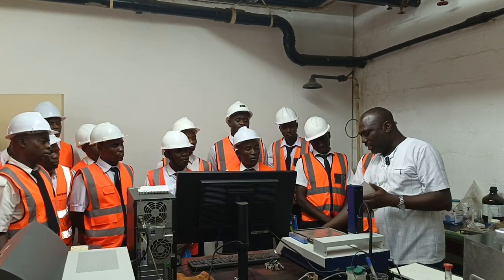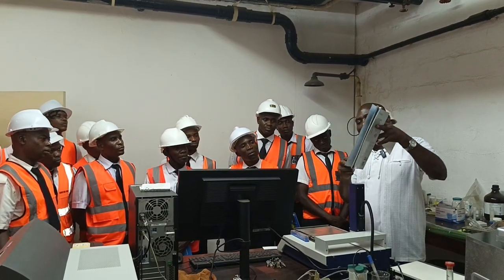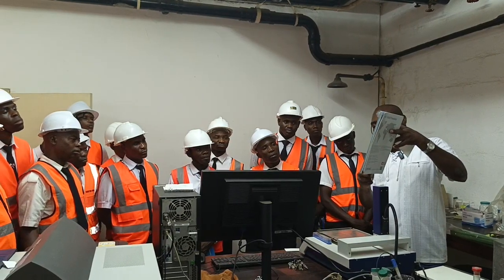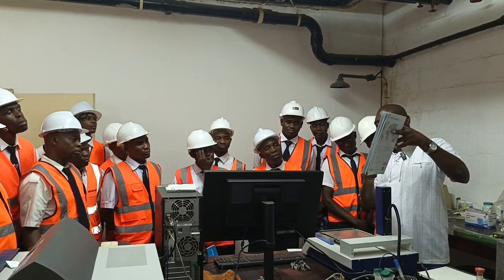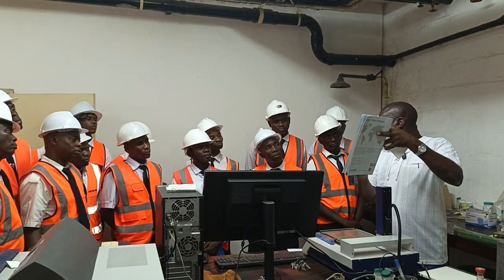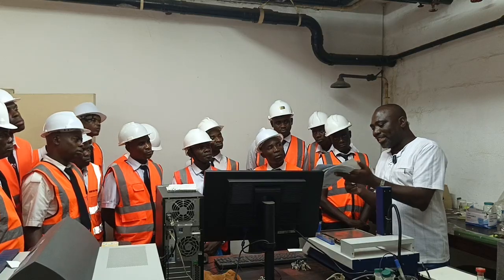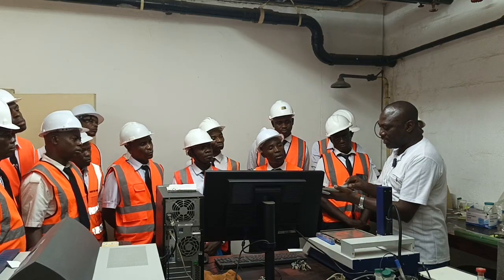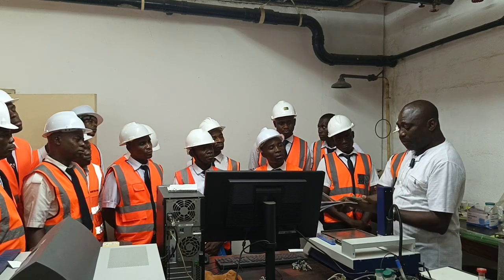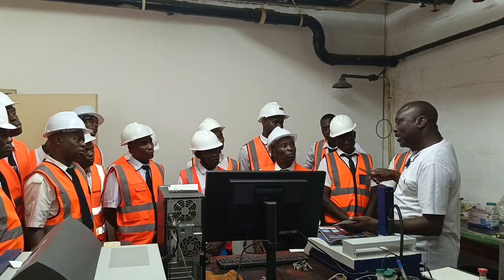So if the components are separated, because this is one of the pictorials, if they are separated like this, this is one compound going this way. There is this, there is this, there is this, there is this. If the compound of interest is this on my plate, I'm able to scratch it, to remove it and get the powder, just like I can do this and remove that powder.